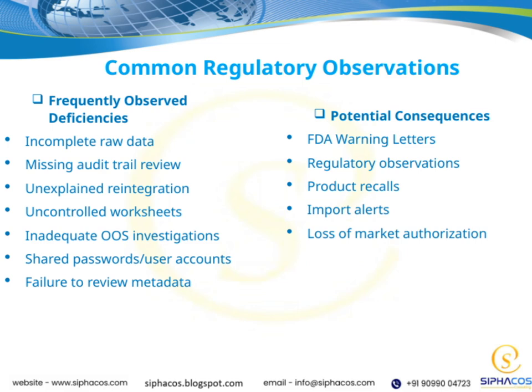In more severe cases, import alerts may be imposed, restricting your ability to bring products into the country. And in the worst scenarios, your product could lose market authorization altogether, effectively removing it from the market. Moving on to common regulatory observations, there are several deficiencies that tend to recur across inspections.